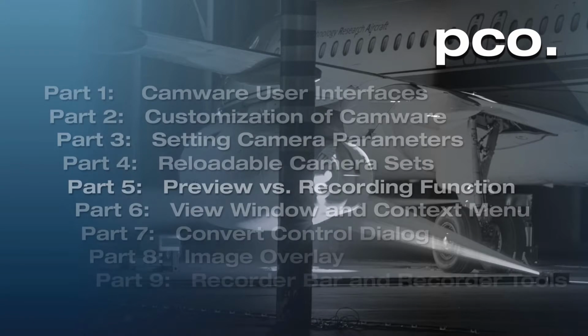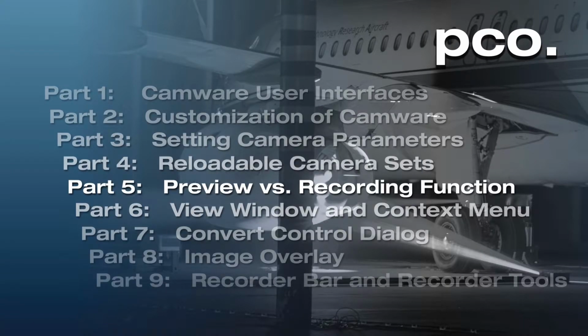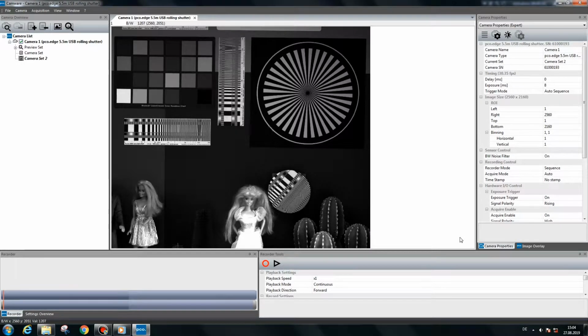Tutorial number 5, Preview versus Recording Function. With this issue, we will introduce the preview mode and the recording function. When you open up pco.camware, an image from each attached and active camera is displayed. If not, click the View window to open up a new View window.